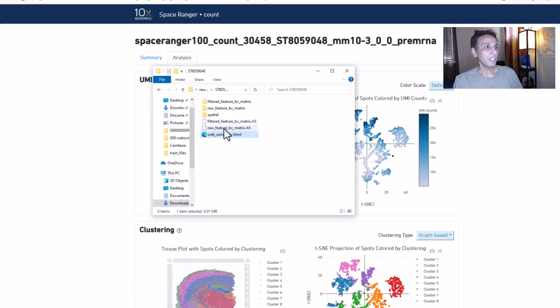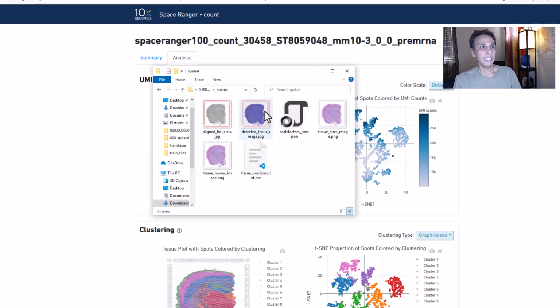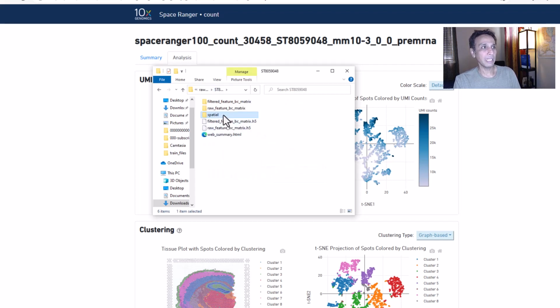They have the H5 files, and these are the ones we're going to read, and these H5 files are pointing to these ones, the raw matrix spatial. For example, if you open this, you get some CSV information about it. Go ahead and look at it, but primarily we will be looking at the filtered matrix that has the barcodes, the features, which means the genes, and the matrix itself. The matrix is basically your cells and what genes are present in there. So these are the datasets, and each is a TSV file that's just compressed, and we'll be opening this. In fact, we are reading H5.